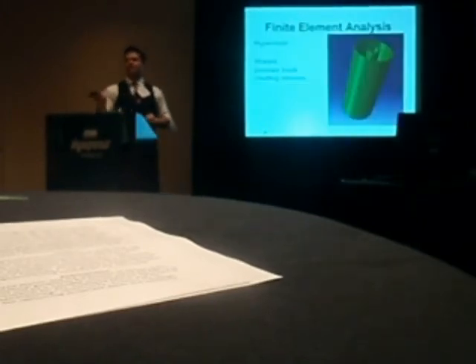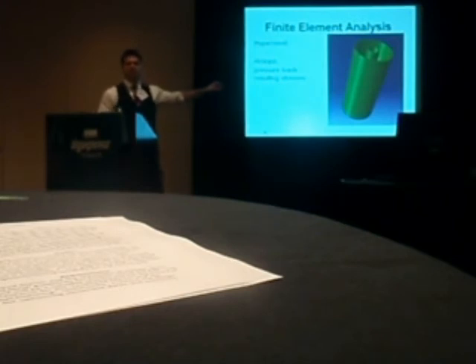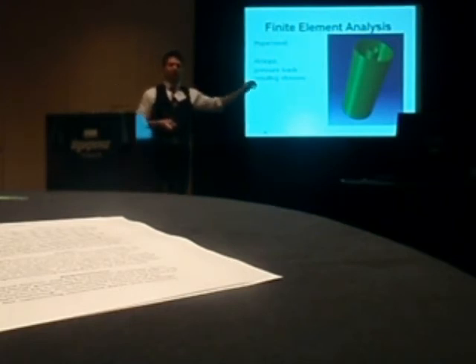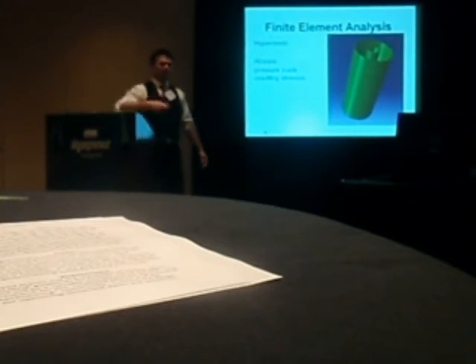Then when we had these dimensions, we took this and put it in HyperMesh and used a program called Abaqus to basically understand the loading and shear forces on our tank, to make sure it stands up to, you know, accidental people falling on it, whatever.